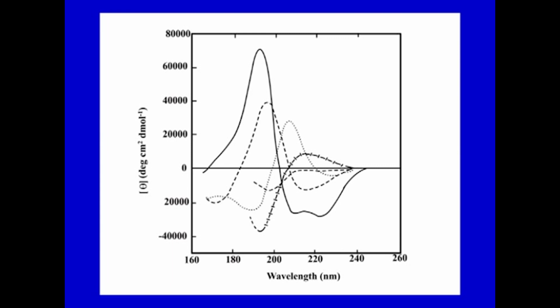So, for beta conformation, this clearly shows that beta sheets do not give a very clear absorptivity as compared to alpha helix. Then there is this curve here, for particular random structures. The dotted lines here give 310 or other kinds of structures.